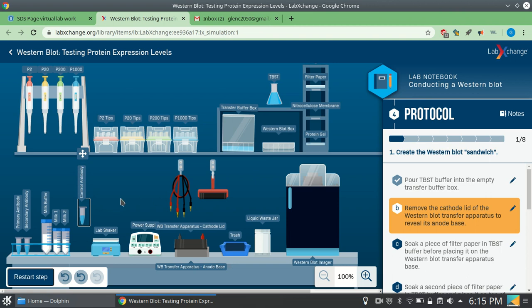The reason why you have to do that is because suppose you do a Western blot experiment and you show the other scientists, when you publish this article, your work and they're like, yeah, I see that you're trying to show us that your edits remove this protein, but actually, your work just shows us that your Western blot technique doesn't work because I don't even believe that you actually edited anything.